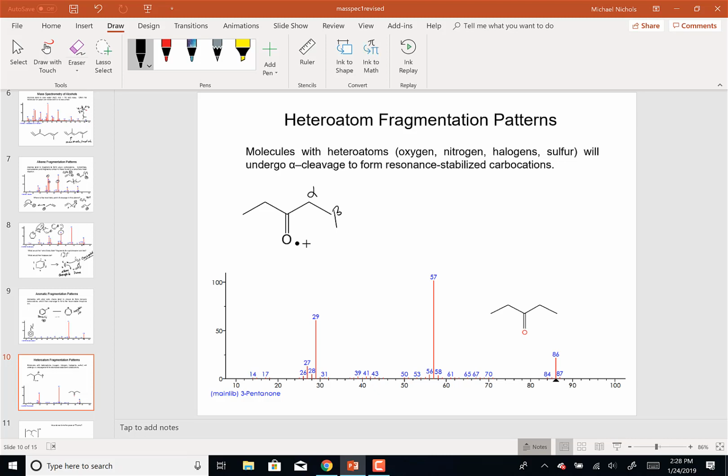We'll use this later on because we're actually going to take a hydrogen off of that alpha carbon and make what's called an enolate. So all the action happens at an alpha carbon in a ketone, an aldehyde, in a carbonyl. So what's alpha cleavage? Alpha cleavage is when you cleave between the carbonyl and the alpha carbon. And so what do you make? You make that.